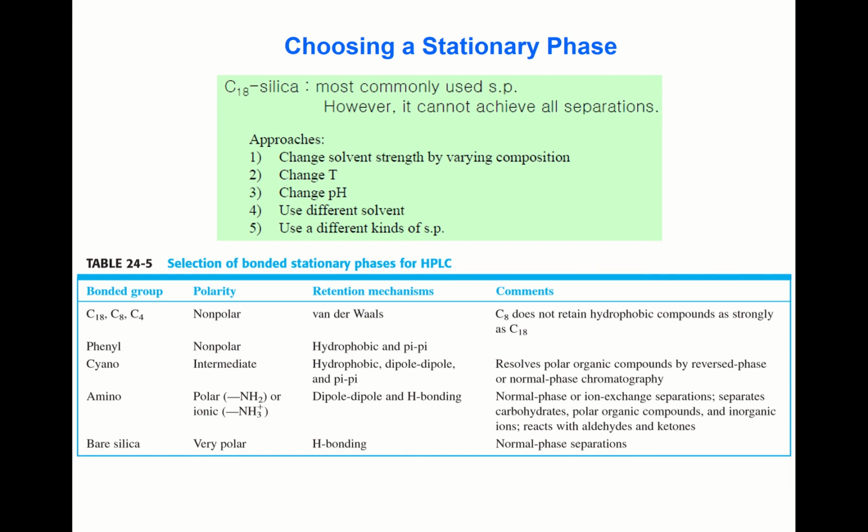So when solute molecules have pi electrons, there are pi-pi interactions between the solute molecules and phenyl groups. Hydrophobic interaction is there as well.